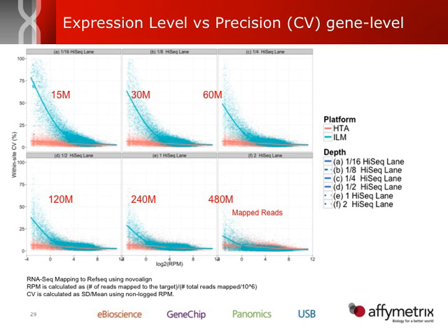So what I want to show you is just a little bit of a comparison between our human transcriptome array and some RNA-Seq or next-generation sequencing data. So I'll orient you to the figures, and then we're going to have two slides that talk both at the gene level, which is this slide, and then the next slide will talk more specifically about exon-level expression.